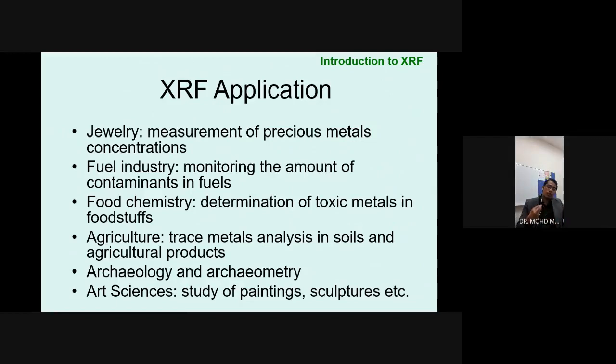So to ensure that your gold is the real one, you have to make a system, or a process, to determine the percent of the gold, by having the fire assay. So fire assay is the very conventional method. Nowadays, a fire assay will destruct your sample, so your material is gone.